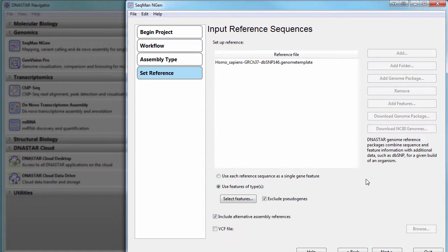Note that if you plan to combine your ChipSeq results with RNA-Seq or any other data, it's important to use the same reference sequence or package for both assemblies.